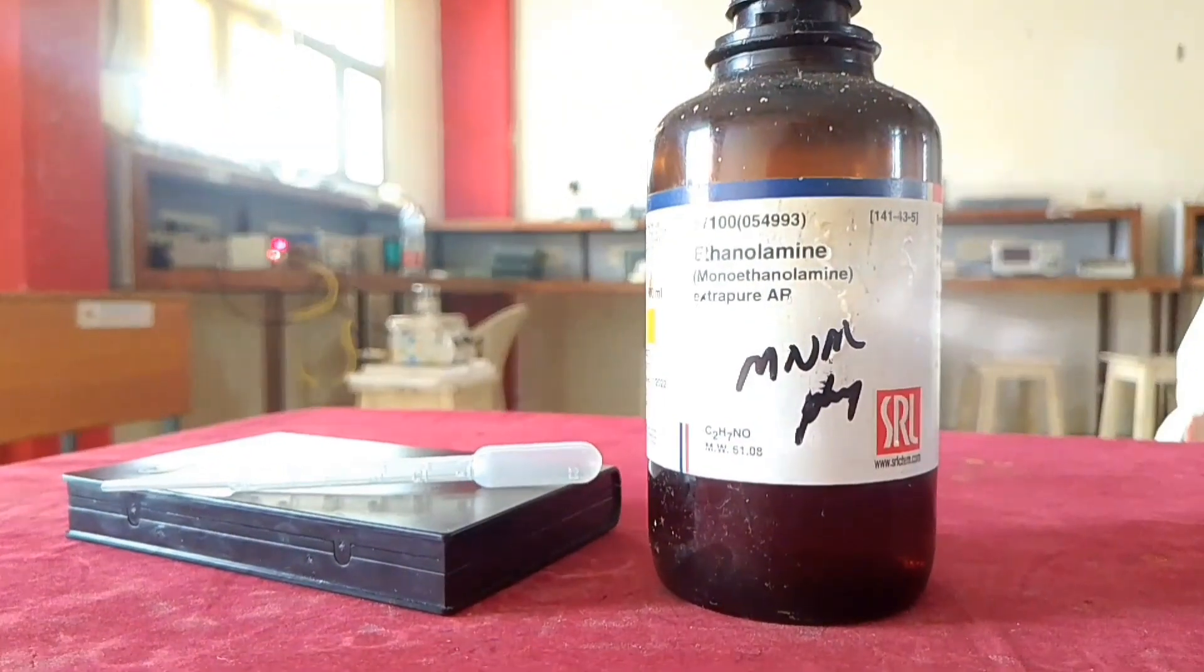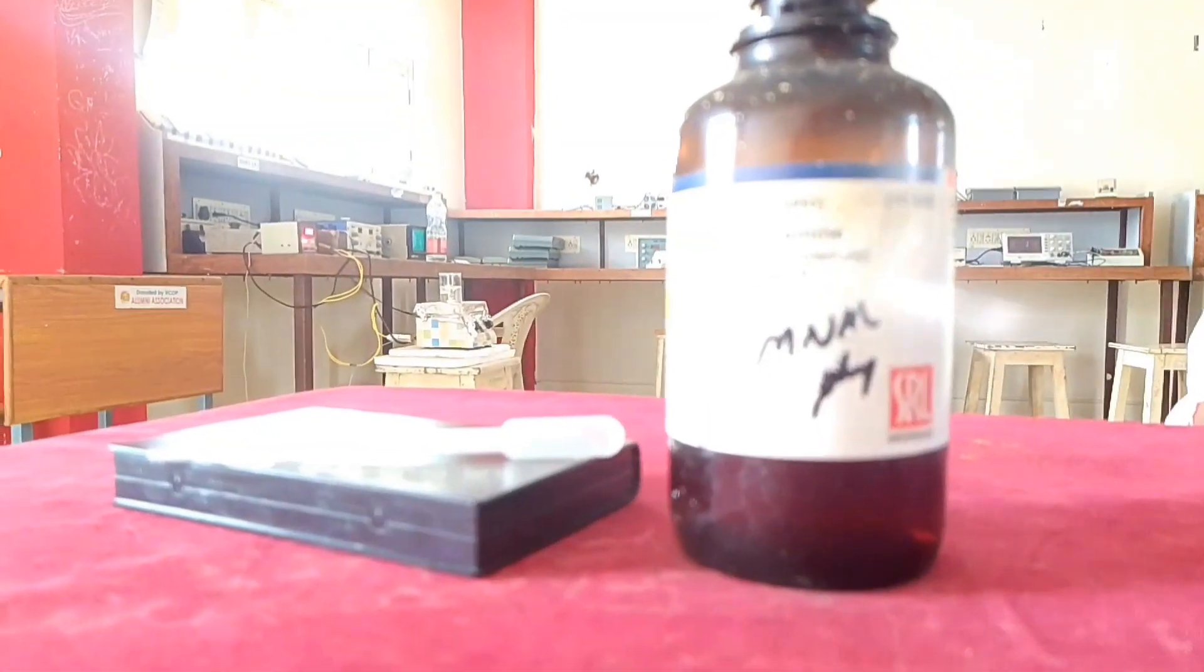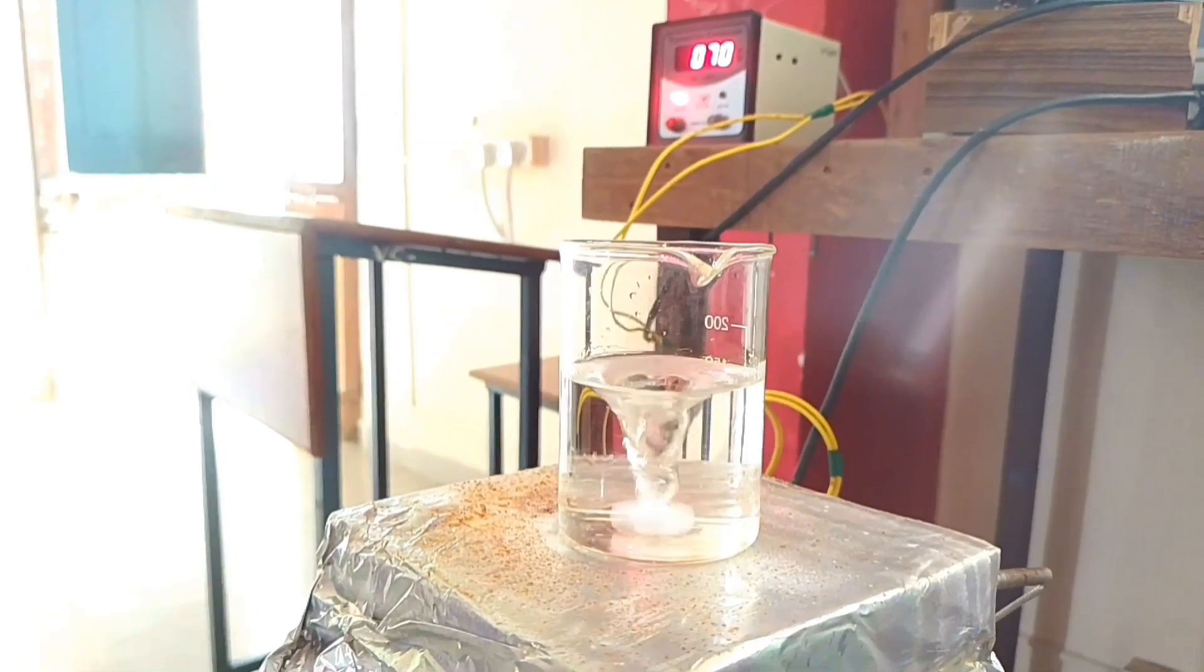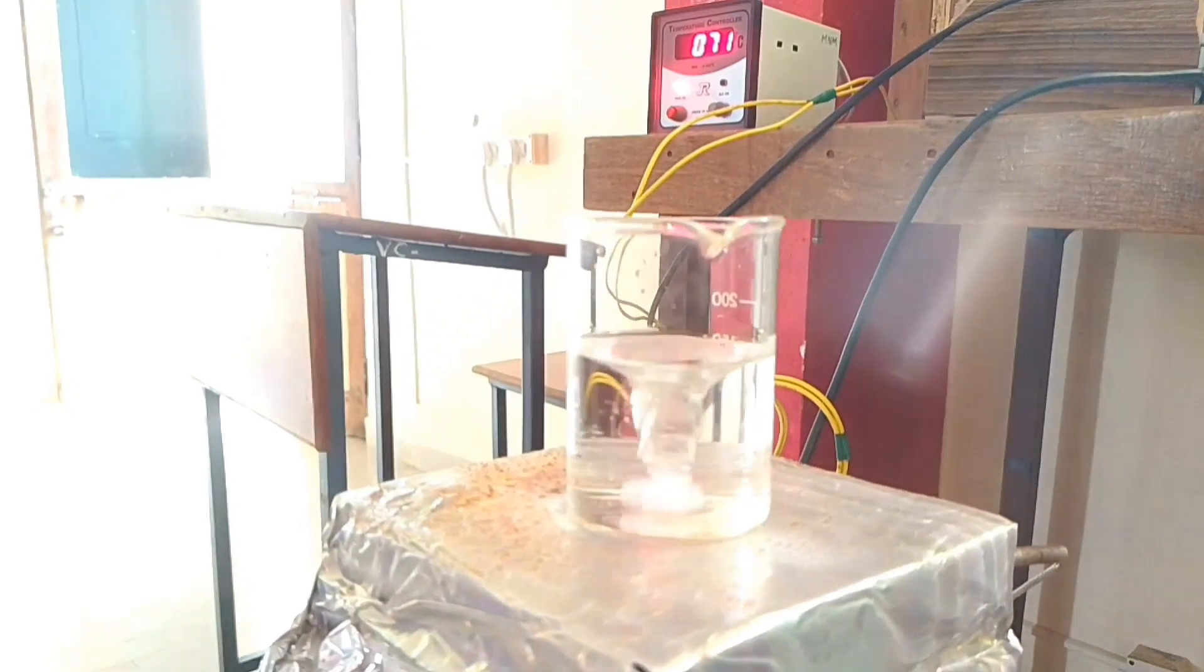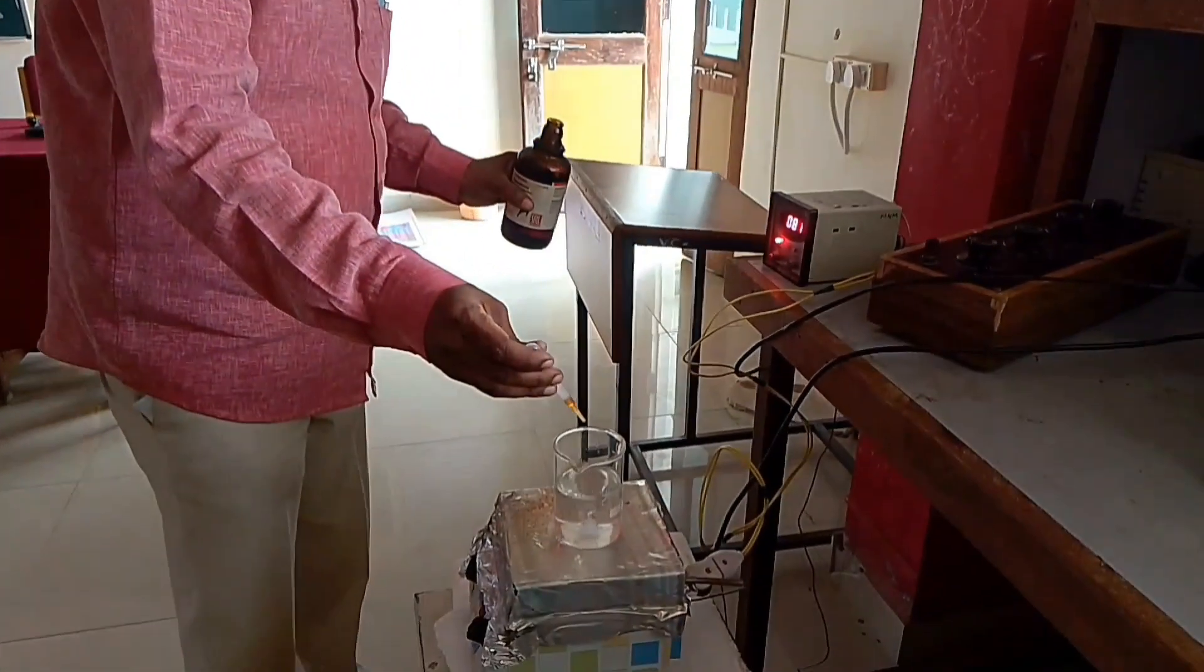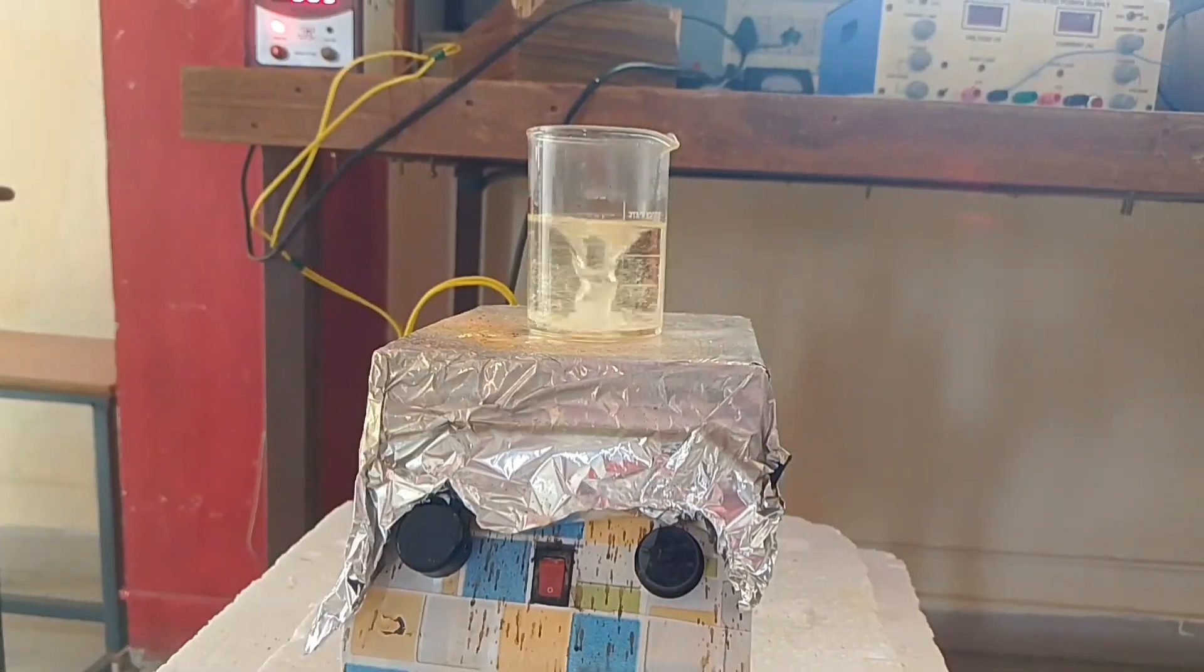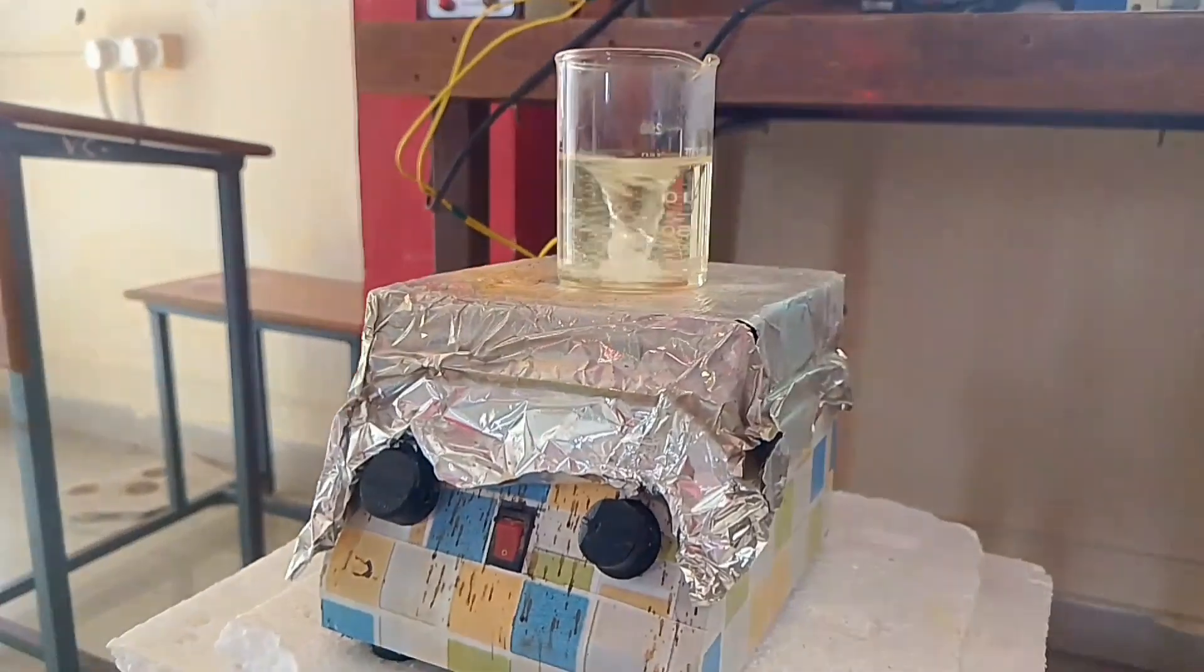After five minutes of stirring then I am going to add nearly 1.8 to 2 ml of monoethanolamine. Monoethanolamine is going to control the pH value, not only pH value it is going to control the particle agglomeration and it is helpful in controlling the uniform particle size. It is continuously stirring; you can see a homogeneous zinc complex solution is obtained.